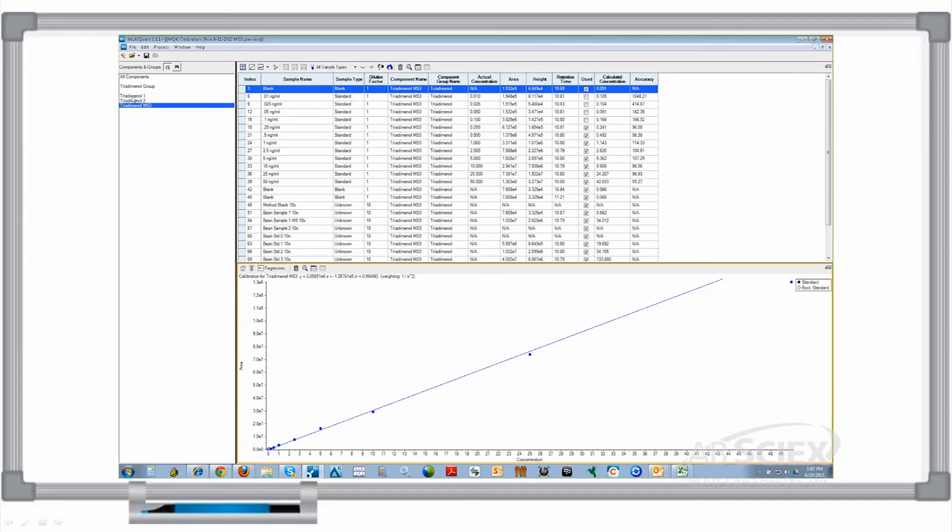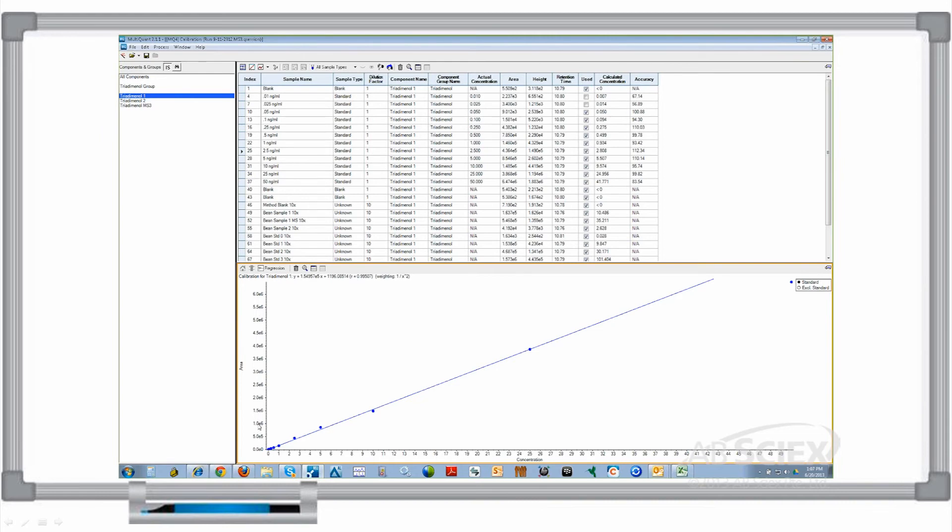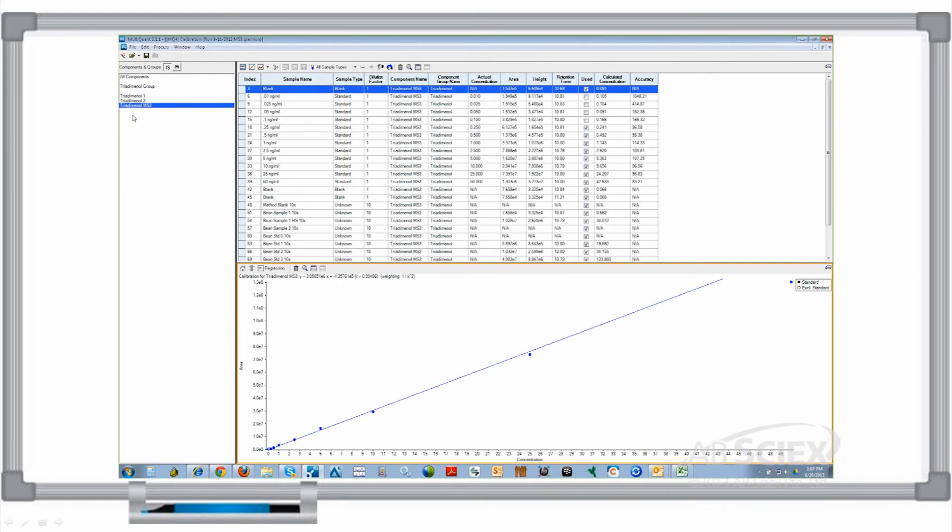When we review the calibration curves for the MRM transition, denoted here as triadminol 1, and MS to the third or MRM-cubed transition, denoted here as triadminol MS3, you can see that the curves are nearly identical with regression R values of 0.995 for both.